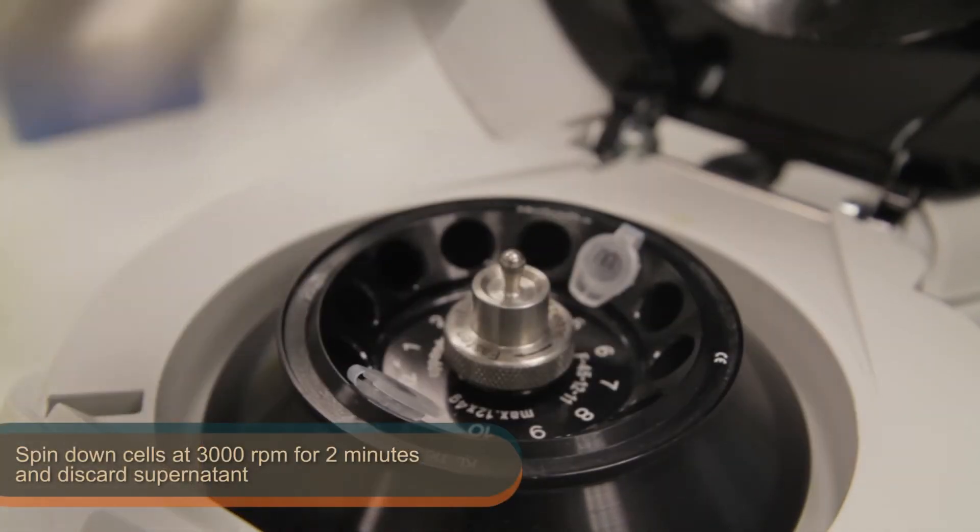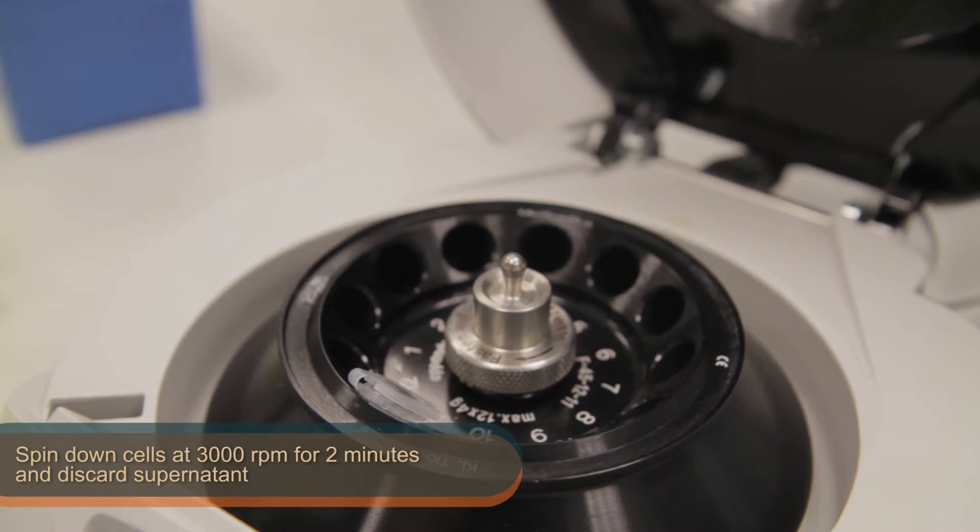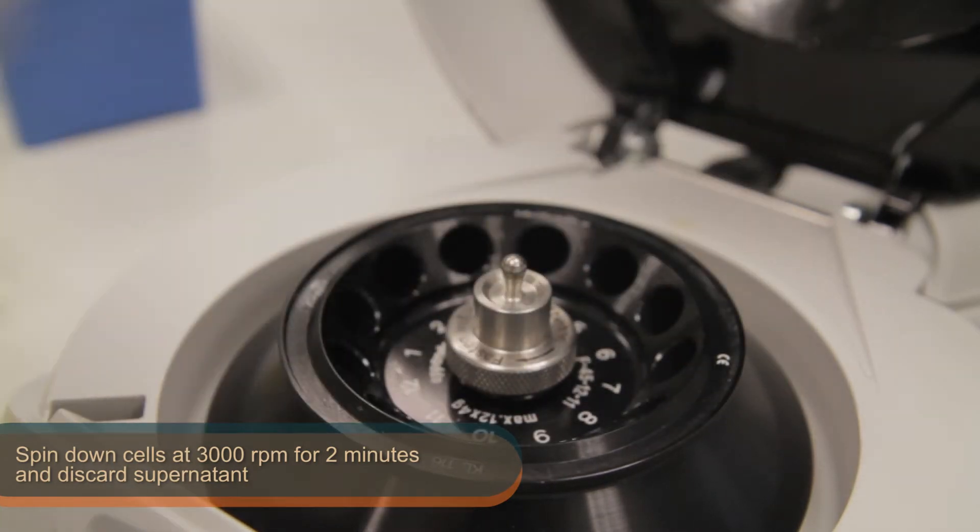Then, spin down the cells at 3000 rpm for 2 minutes and discard the supernatant carefully.